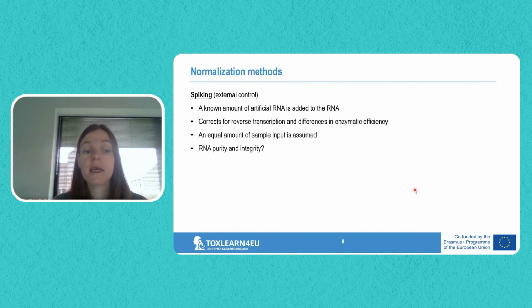However, in this case, an equal amount of sample input is still assumed. And again, this does not tell you anything about the RNA purity and integrity of your samples. So also not the most ideal method.